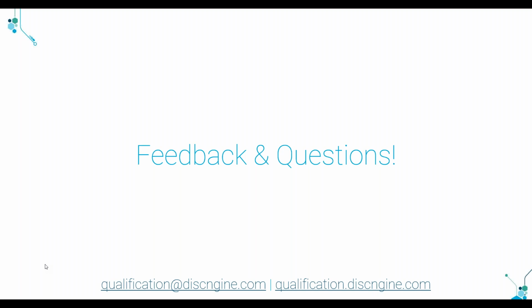Okay, thank you, Alex. Very good answer, I think. The next question is: can I have different cutoff limits, for example, one for each volume? Well, that's a very good question, and it's a question that we get very, very often. So far, we can't. It's not available yet. But this is definitely something that we are currently working on, and it will be available in the next release, to be able to have a different cutoff limit for each volume.